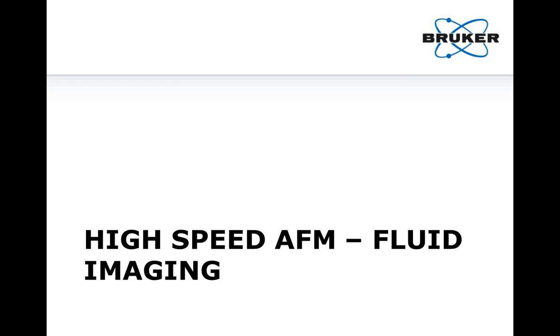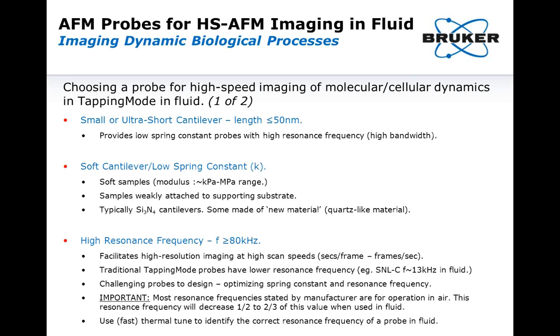Okay, so now we're going to move from performing high-speed AFM images in air to capturing high-speed AFM images in fluid. When choosing a probe for high-speed imaging in fluid, we want to select a probe that has a short or ultra-short soft cantilever with a low spring constant and a high resonant frequency.